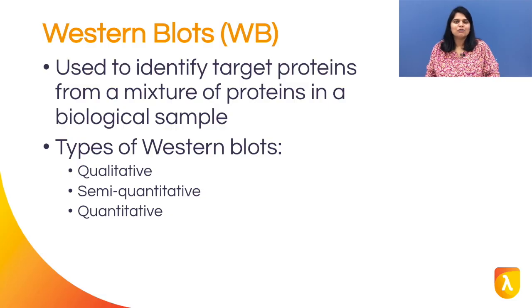Western blots are a powerful analytical tool used by investigators worldwide in research and development, pharma, and food industries. Western blotting technology allows you to separate and identify individual proteins from a complex mixture of proteins that were extracted from biological samples.